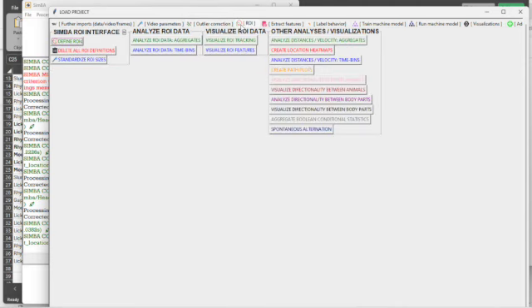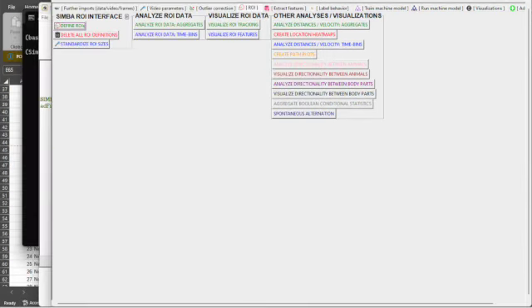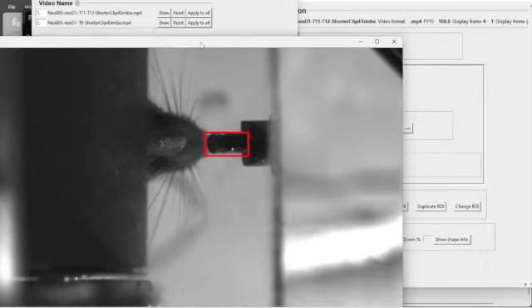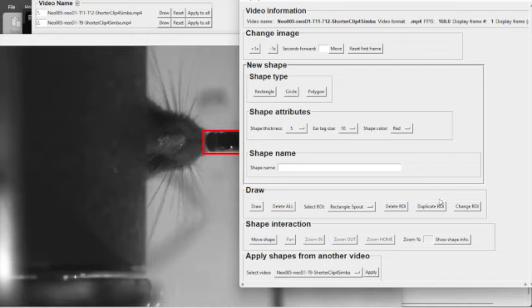So now if I want to create any ROIs, I can do that right now. Here I'm going to select define ROIs, and this box will pop up that shows all of my video clips. I just have 2 right now. I'm going to select that first video clip and draw. So this one has an ROI that I previously drew on it, and I actually want to delete this ROI. I'm going to redefine these.